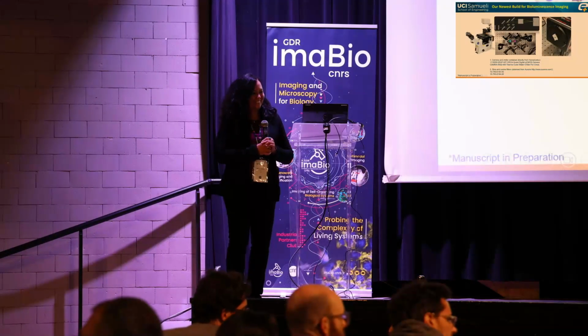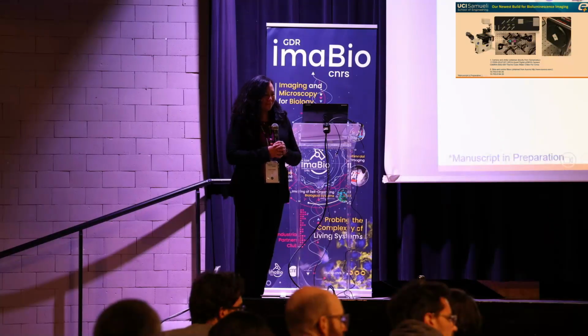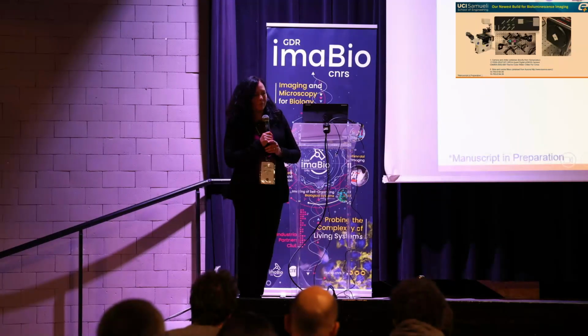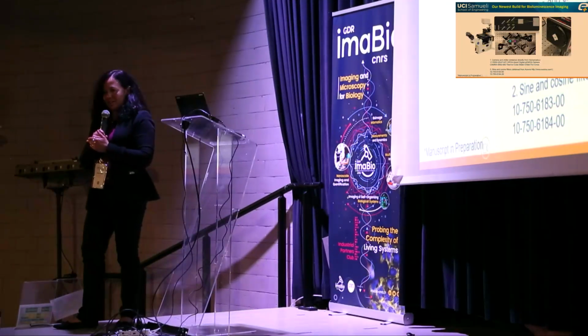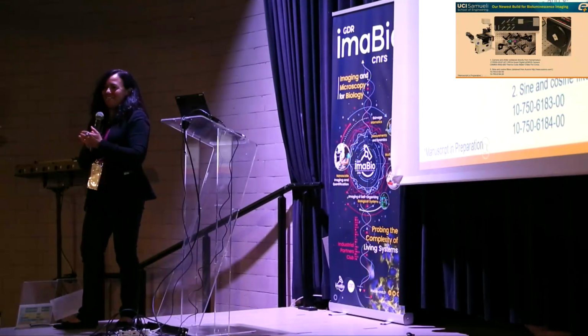Thank you, Michel. I have a question regarding the fact that you can combine the two phasors, the wavelength phasor and the lifetime phasor. Is it possible? Yeah, other people have done that. So Lorenzo and Enrico published a paper where you can simultaneously collect the spectral and lifetime phasors. So yes, and there's actually a commercial company that produces the SLIM, which is spectral and lifetime.